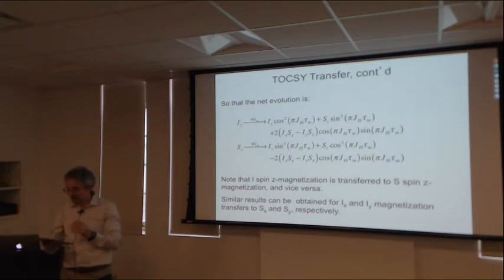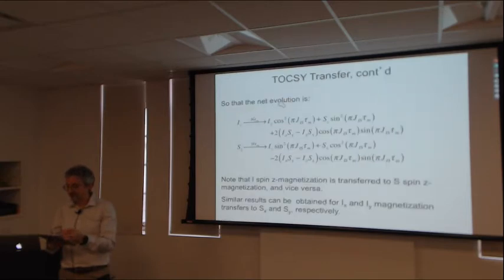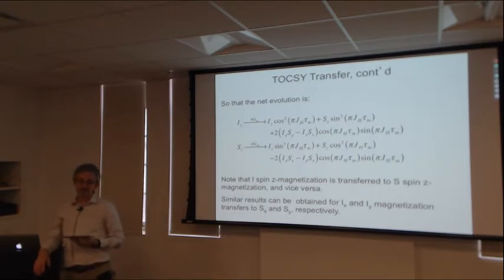The other problem that will come up is we have Z operators. And Z operators also cross-relax through the dipole-dipole interaction. In the presence of an RF field, that's called the ROESY, rotating frame Overhauser effect. So TOCSY spectra contain ROESY peaks. And those also can be a headache.